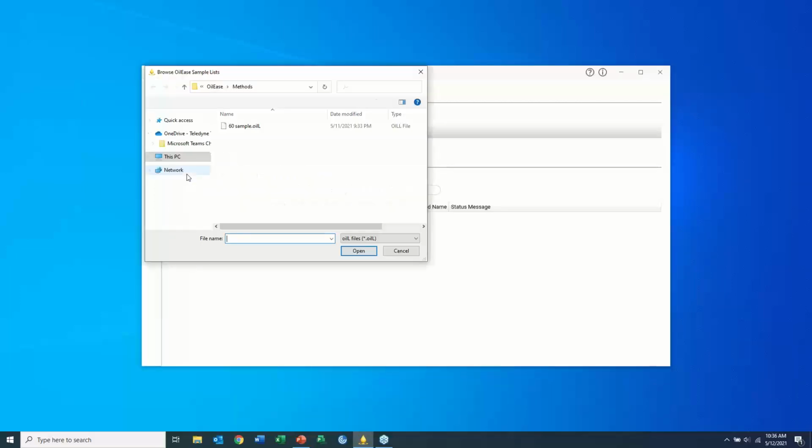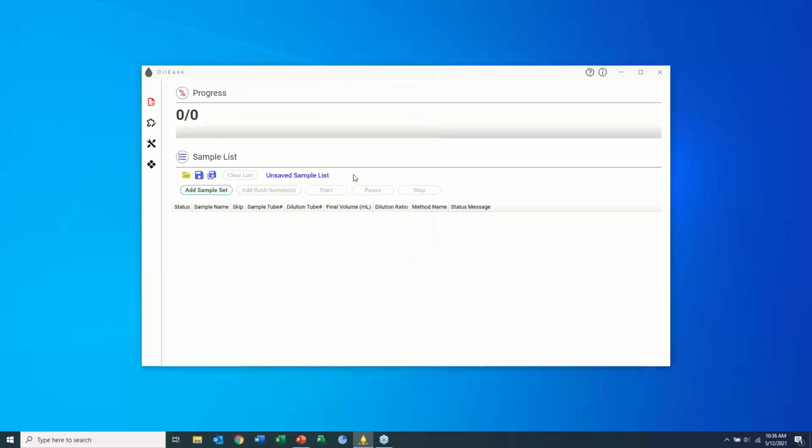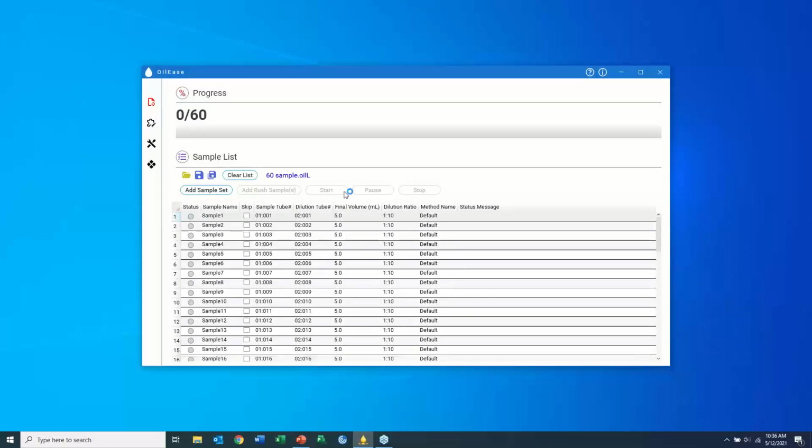And a typical day, all you would do is open a file, right? And then basically run it. There we go. Sorry, I'm trying to take my time on the software and be a little slow so I make sure that what you're seeing is what I'm seeing. So if there's a little bit of lag and pausing, that's just to essentially allow WebEx to try and catch up to match my screen image.